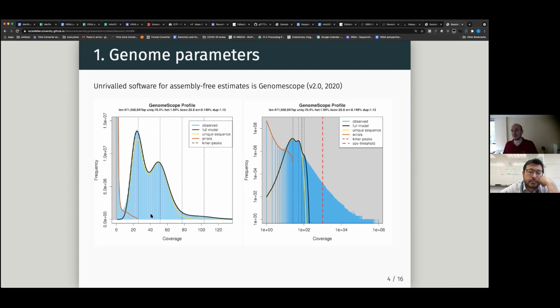Olivier? Yeah, I would like to emphasize this is without any assembly information. I mean, this is quite amazing, right? No alignments, no assembly information, nothing. So everything from the raw data, the complexity has been reduced to K-mers so that you can interpret things. So you do that before doing any assembly or any work. This will tell you how your data looks. I don't know if Julio, you have some example where the distribution looks weird or there is something wrong with the data, right?